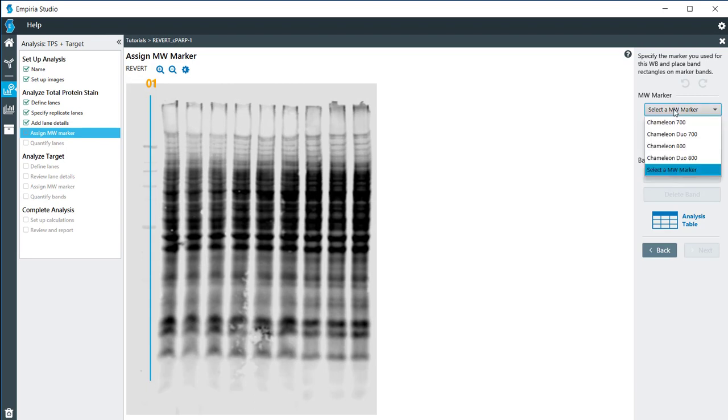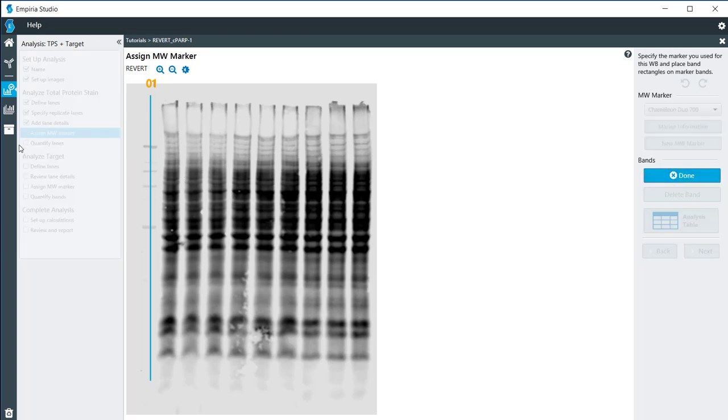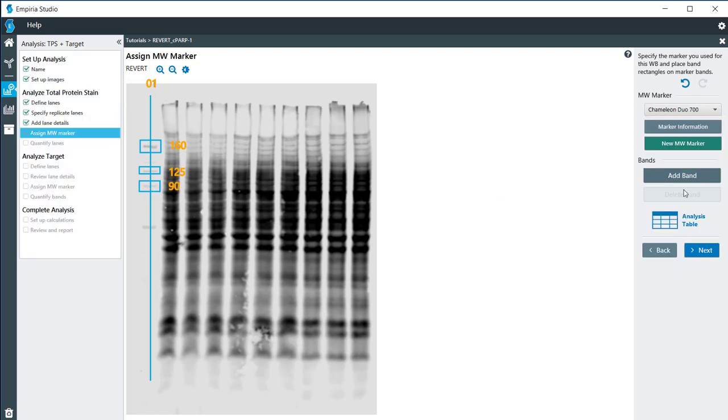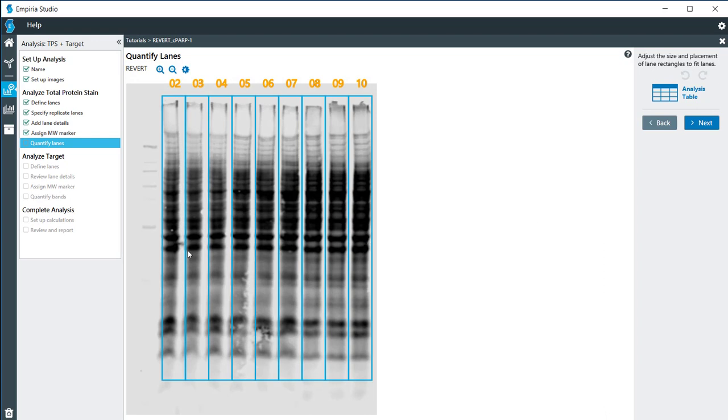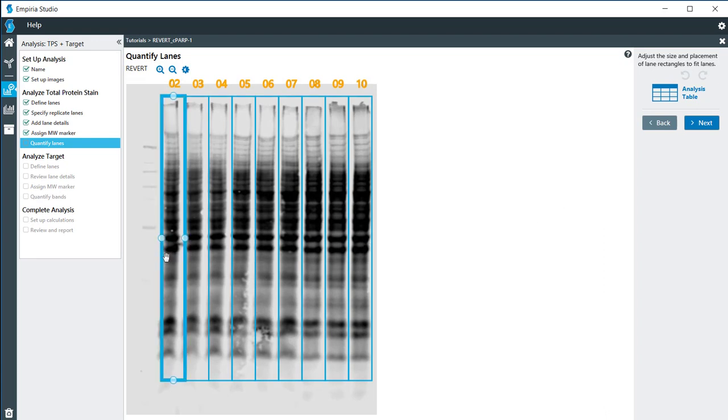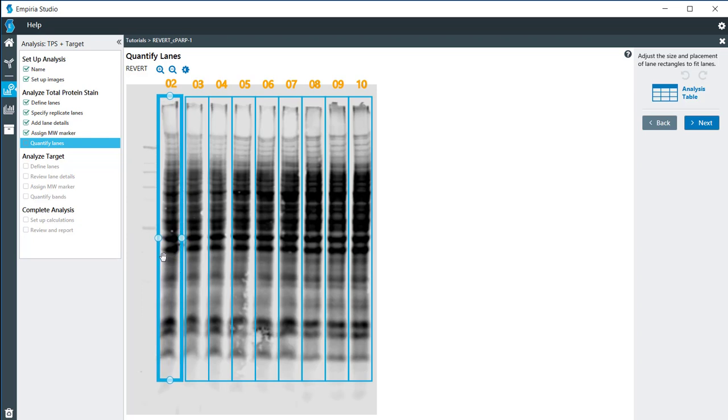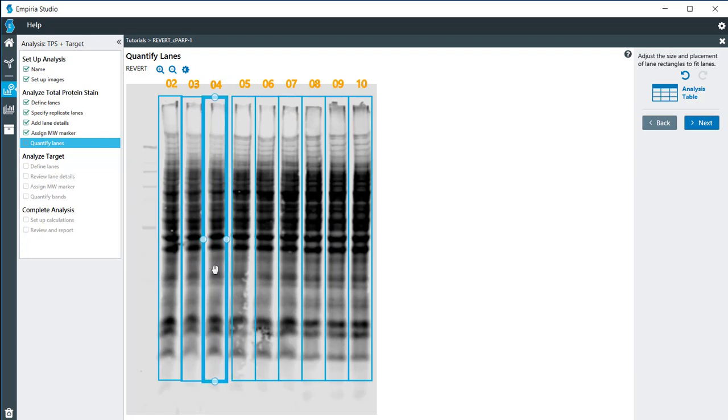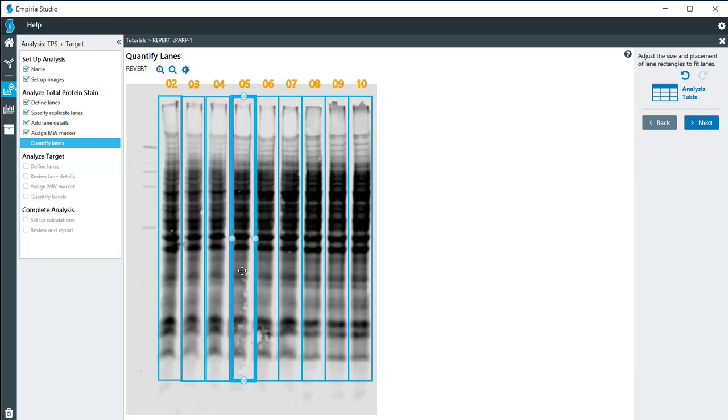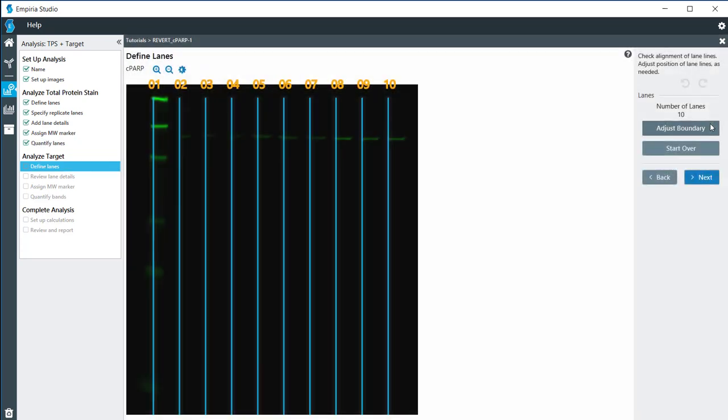As with other Revert images that we've worked with previously in the tutorials, we do have to set a marker, even if it's not really used for the Revert staining, and add a couple of band markers on here so that we can move to the next image. Here I'm going to adjust my lane location slightly so that it gets all of the Revert signal. It looks like the rest of them are good, so I'm going to go ahead and click on Next.